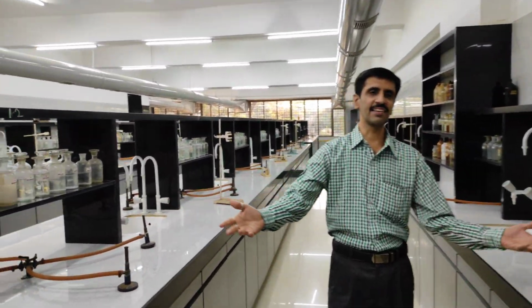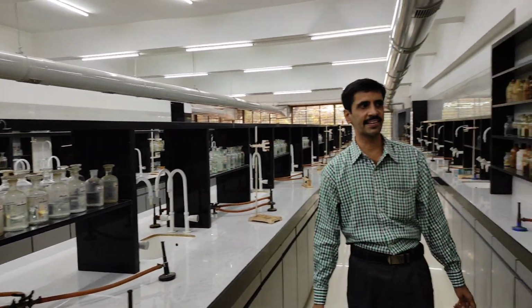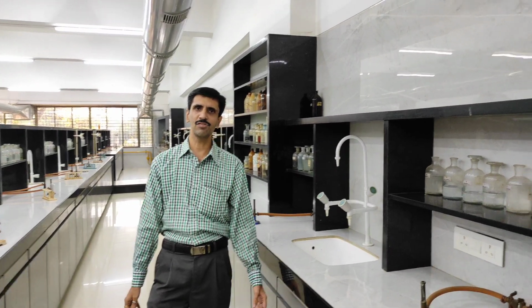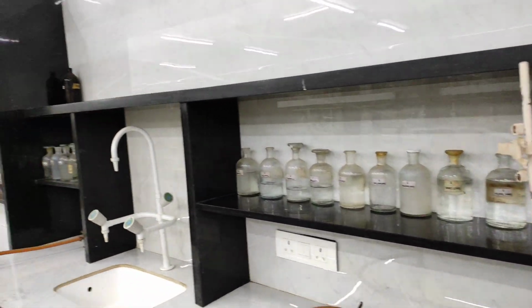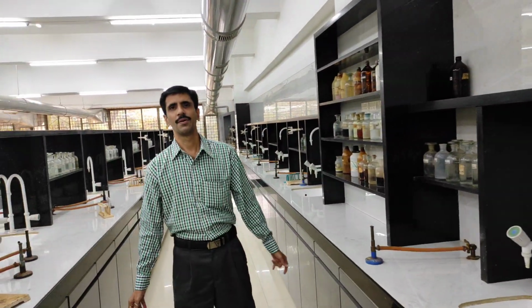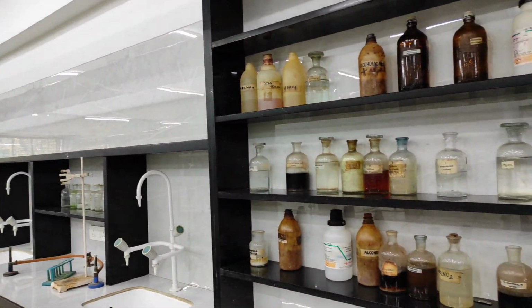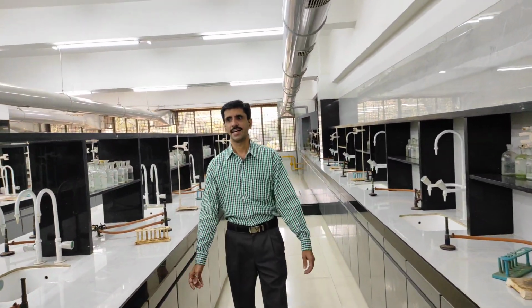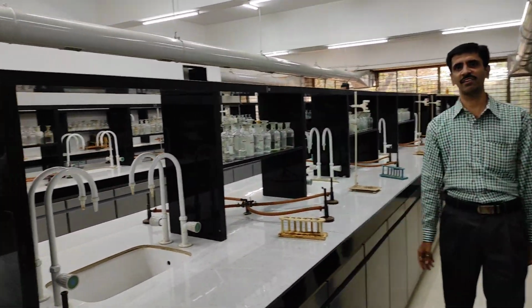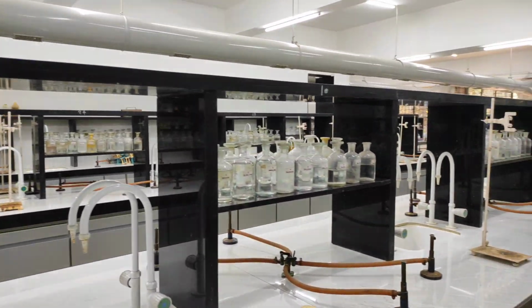As you go ahead, you can see these wash basins. Water is required for all the experiments that are to be conducted. You go towards the side shelves, which hold chemicals and reagents. Here we have another special side shelf where we have specific chemicals to be used for specific experiments. We have a test tube holder and the gas connections, which are so vital for carrying out chemical experiments.